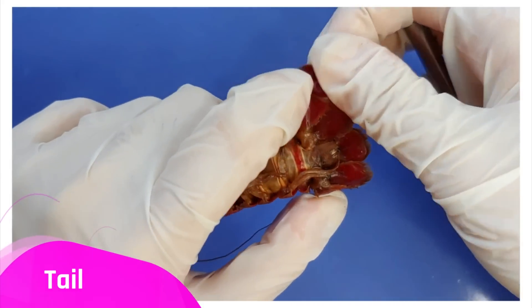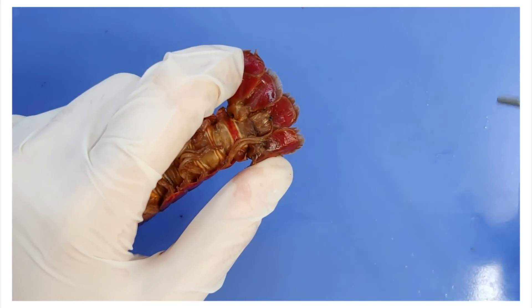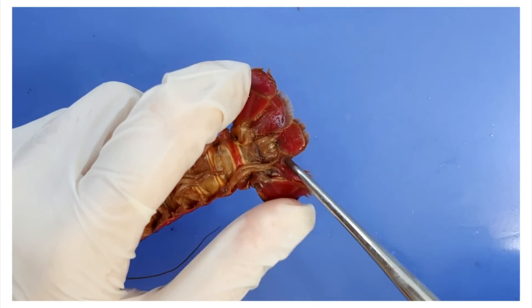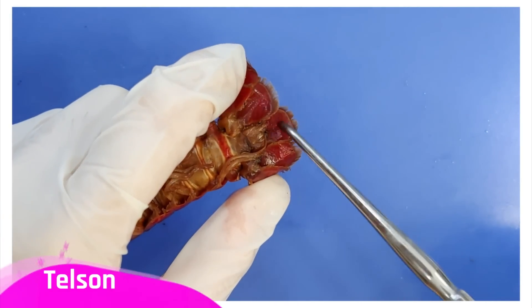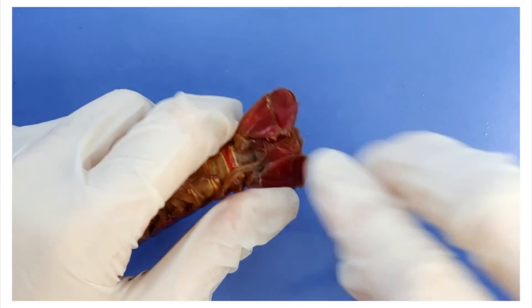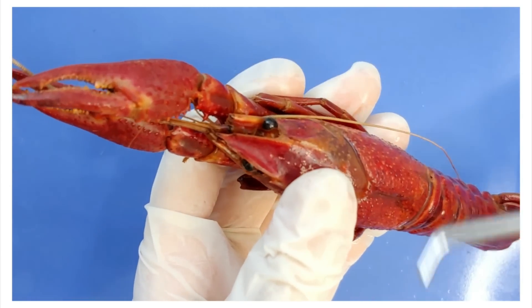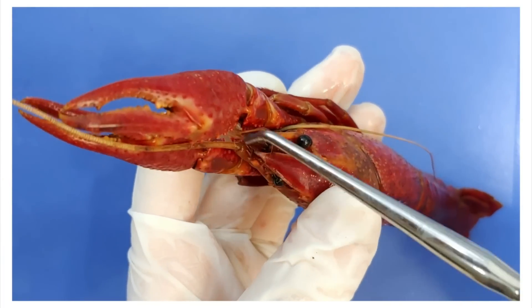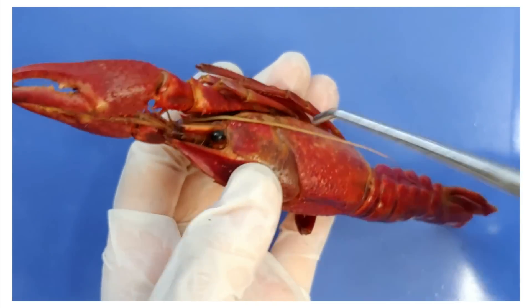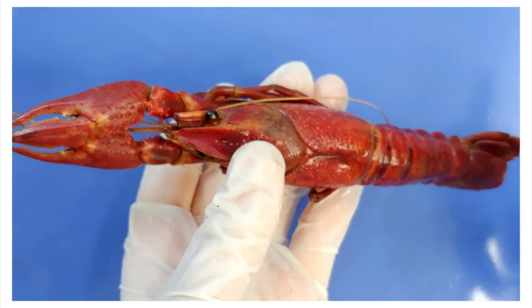Its tail here is in a fan shape, and it helps propel them through the water. These segments here are called uropods, and in the middle of the uropods is a structure called the telson. Going back to its head, you can see that the crayfish has two pairs of antennae here. Crayfish often live in murky water, and they can also be active at night, so these antennae are important in helping the crayfish move around when they can't see.